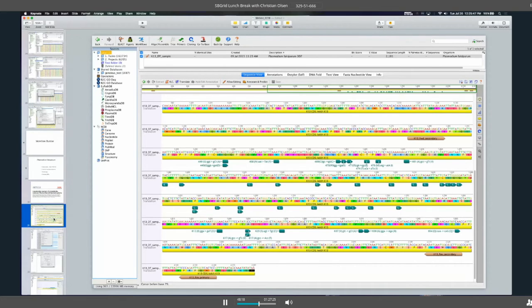So in this case, I've got the K13 CDS annotation, which is on my sequence, and it's shown there in yellow. And then I added custom annotations, which are those green blocks for canonical SNPs. These are SNPs that we mined from the literature and we annotated onto our reference sequence. And this custom reference sequence that we made is what we included in the workflow.